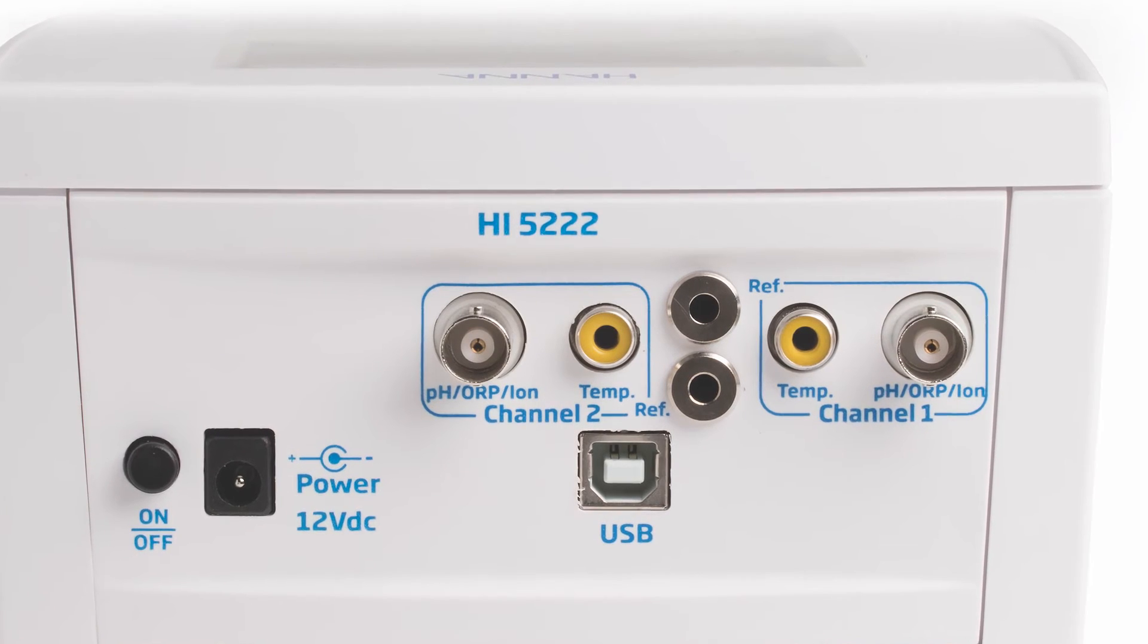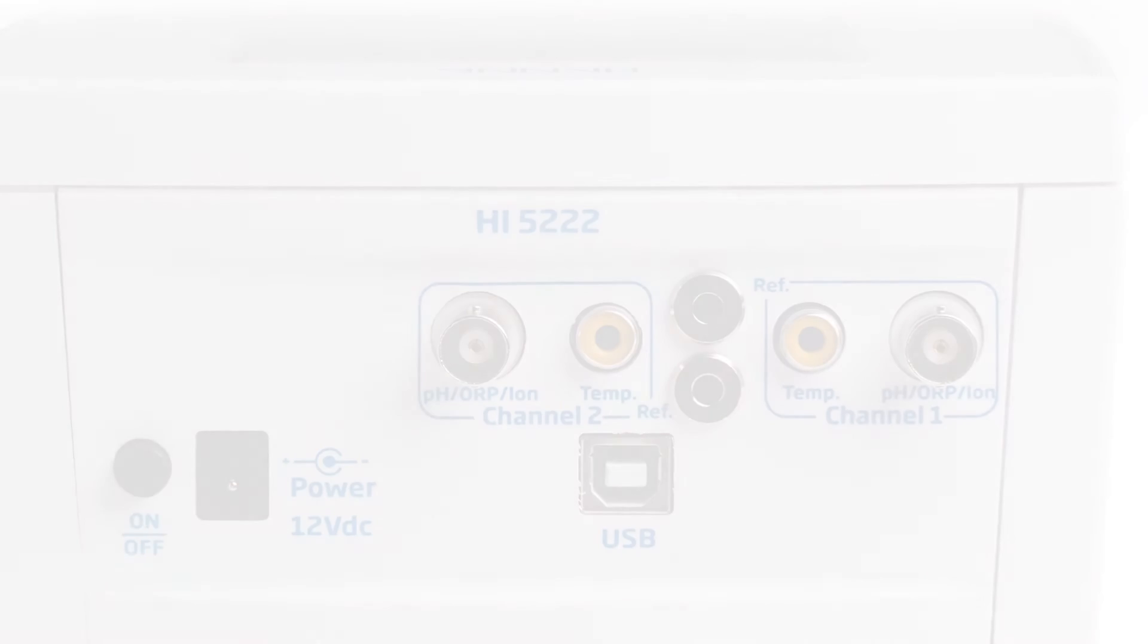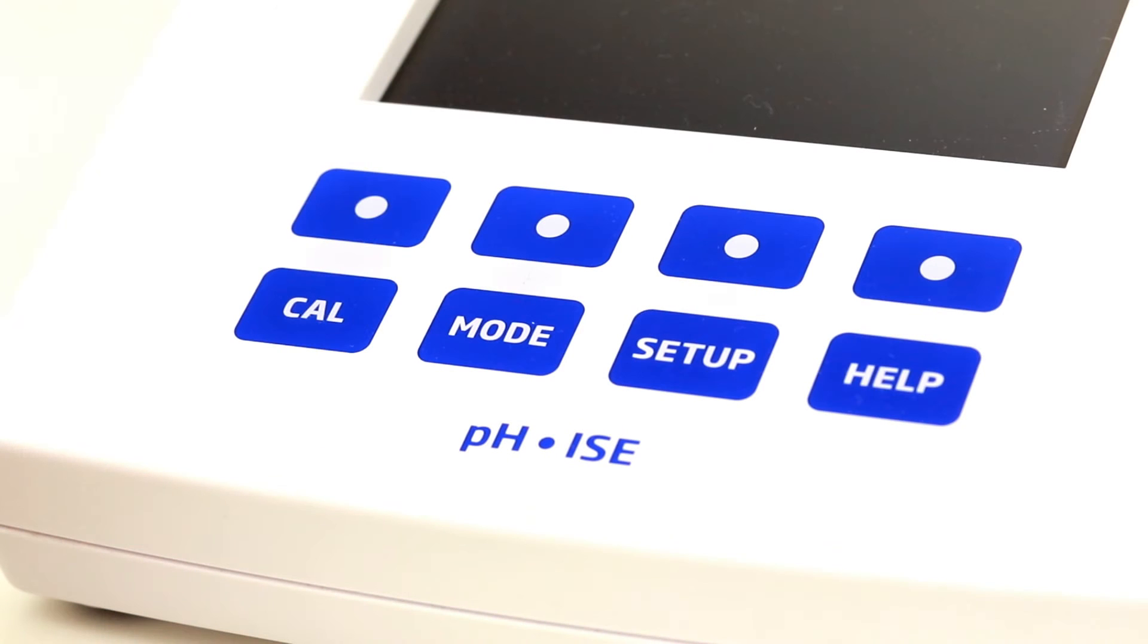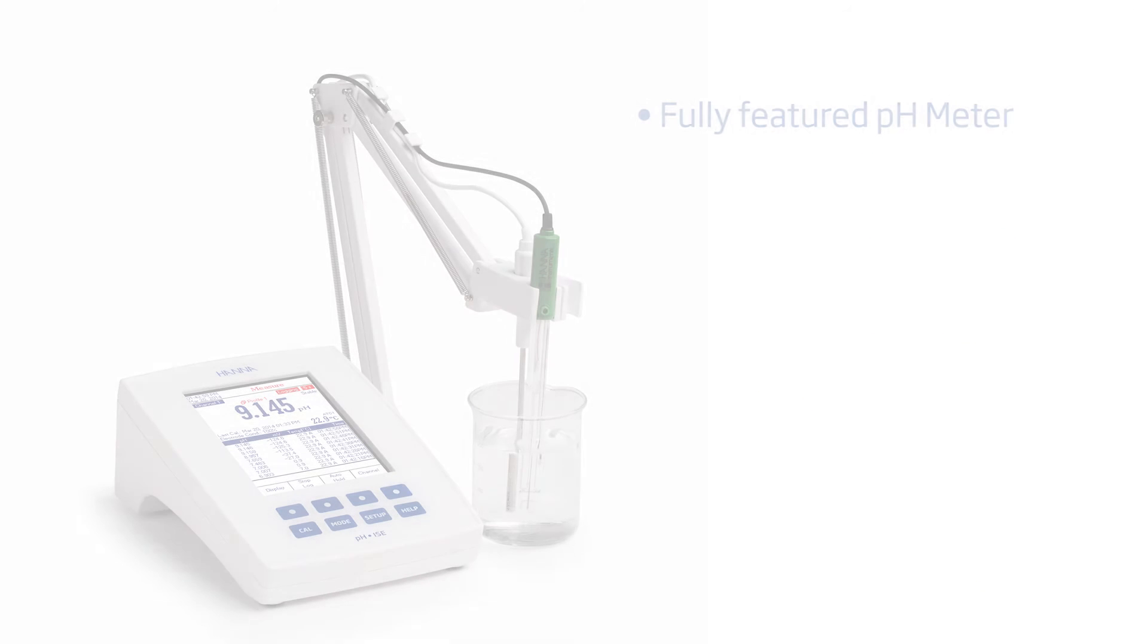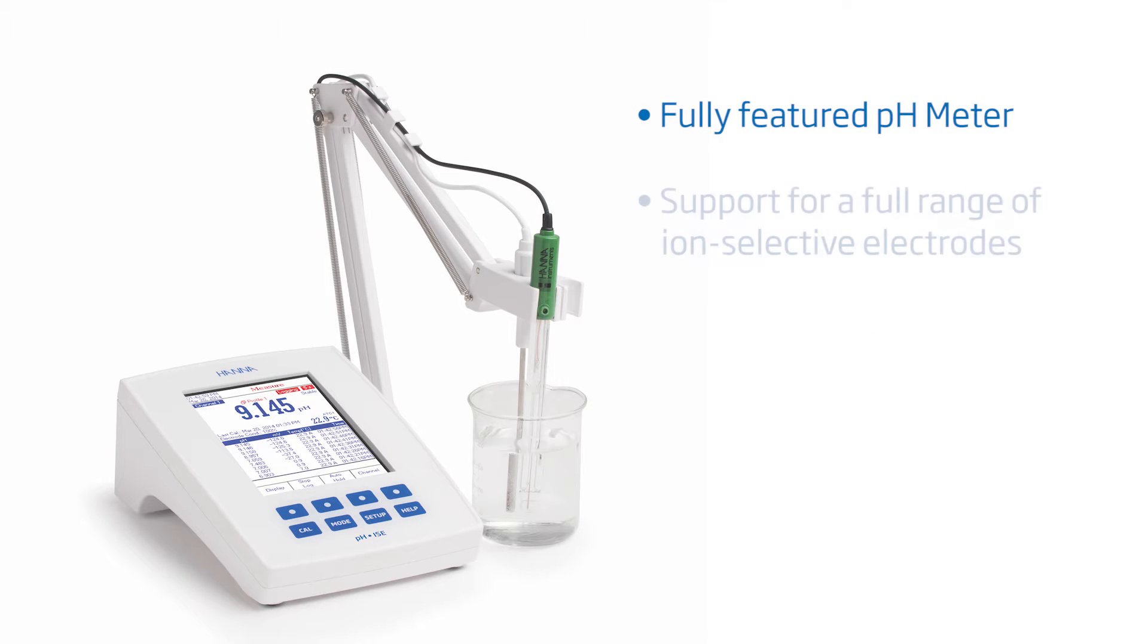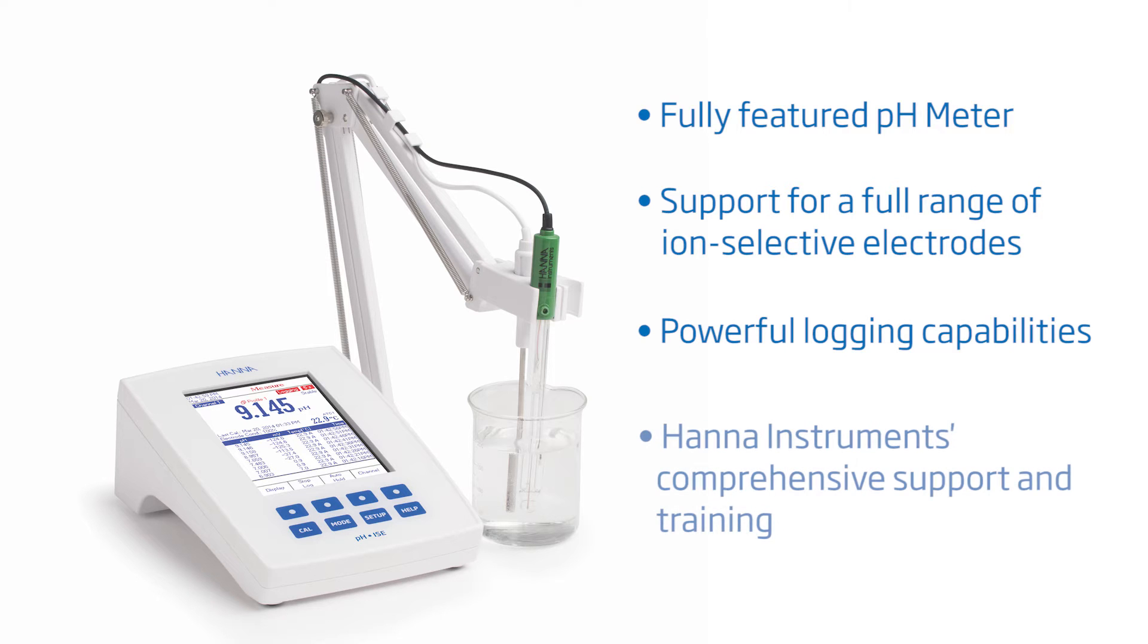The HANA HI5222 two-channel meter does more than just titration. It also has a wide range of features: fully featured pH meter, support for a full range of ion-selective electrodes (ISEs), powerful logging capabilities up to 100,000 data points, and HANA instruments comprehensive support and training.